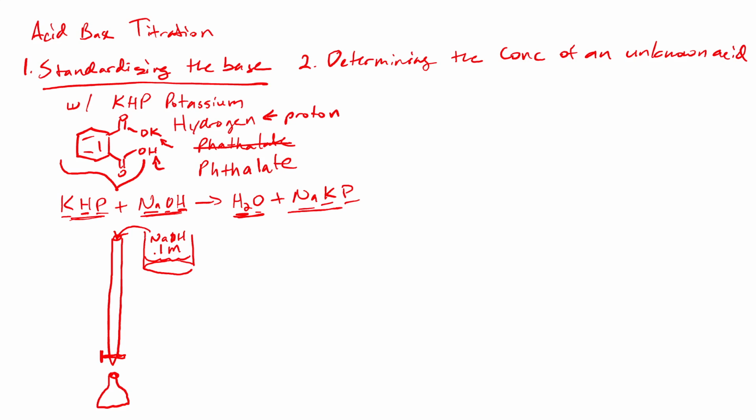You have this beaker right here, and you're going to put that sodium hydroxide into the burette, okay? You'll fill it up, and I recommend filling it all the way to the top where the zero marker is, where the line is 0, also known as 0 milliliters.